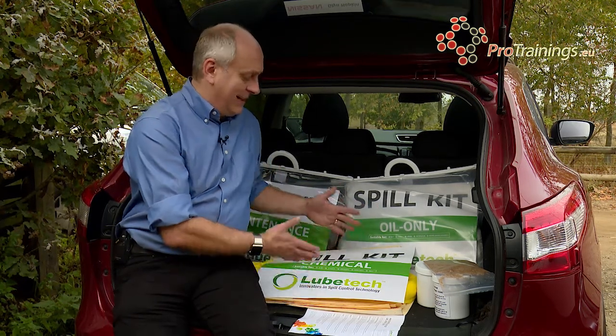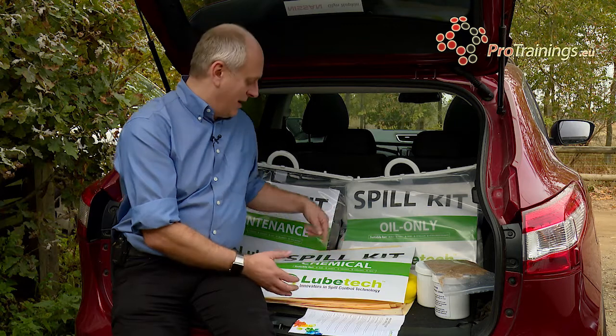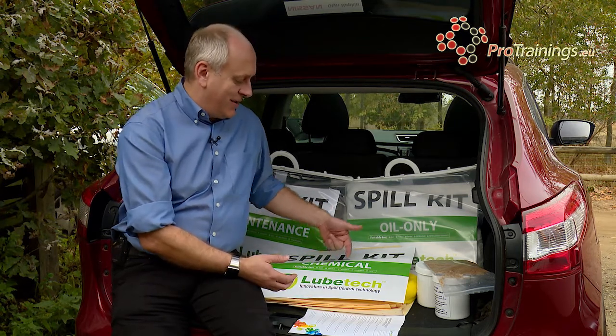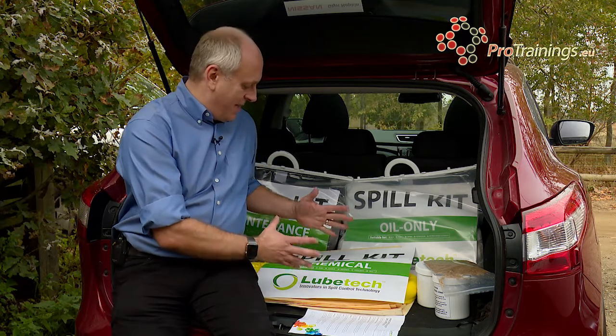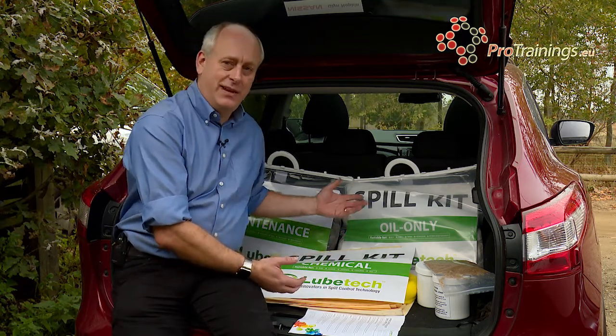The one we are actually going to look at here is the chemical kit. This works slightly differently because it is suitable for acids, alkalines, solvents, coolants and oils. This will be able to take acids and alkalines much stronger than the others would.